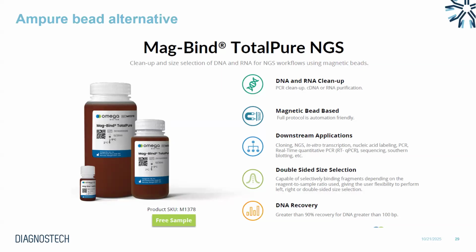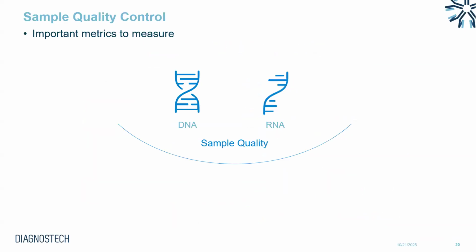So now that we have high quality starting material, we need to have a look at QC in an NGS workflow. So there are generally 4 parameters to measure when evaluating sample quality in an NGS workflow. One is to calculate the size distribution, or sizing. The next is to determine the concentration or the yield of the sample. We need to know if there's sufficient material for the downstream process.